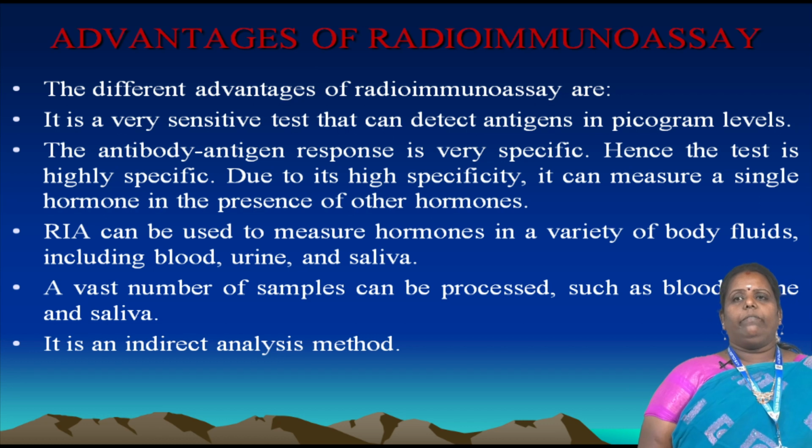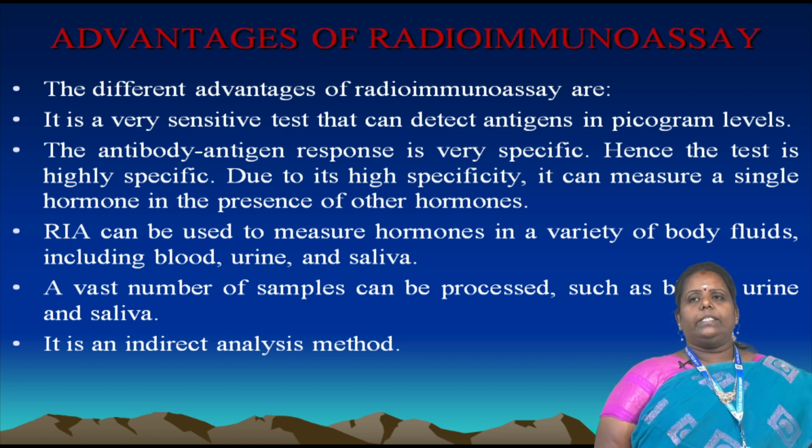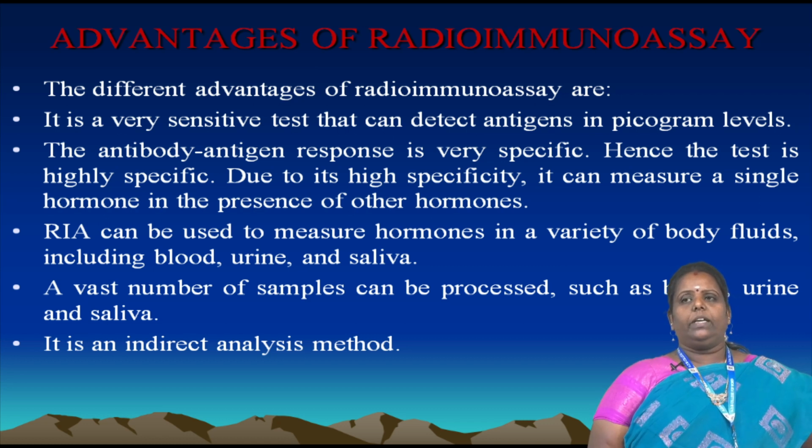It is normally a very sensitive test, and it can detect the antigen at picogram levels. The antibody-antigen response is also very specific. Hence, the test is highly specific. Due to this high specificity, we can measure a single hormone in the presence of other hormones.